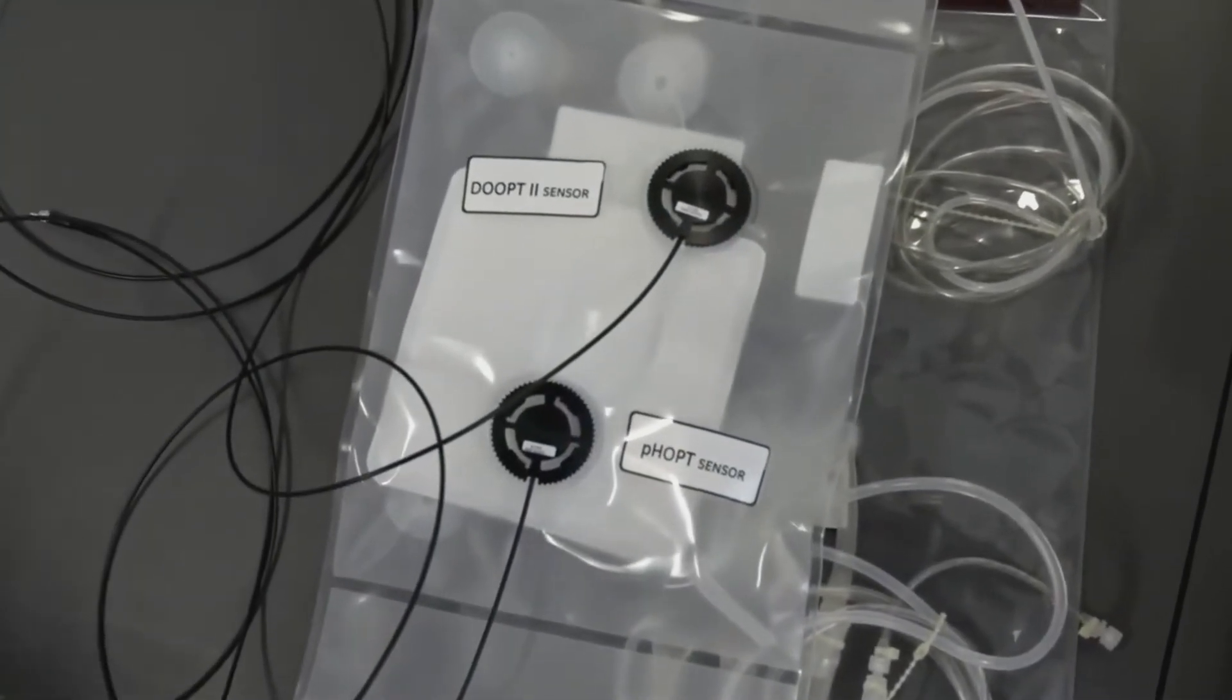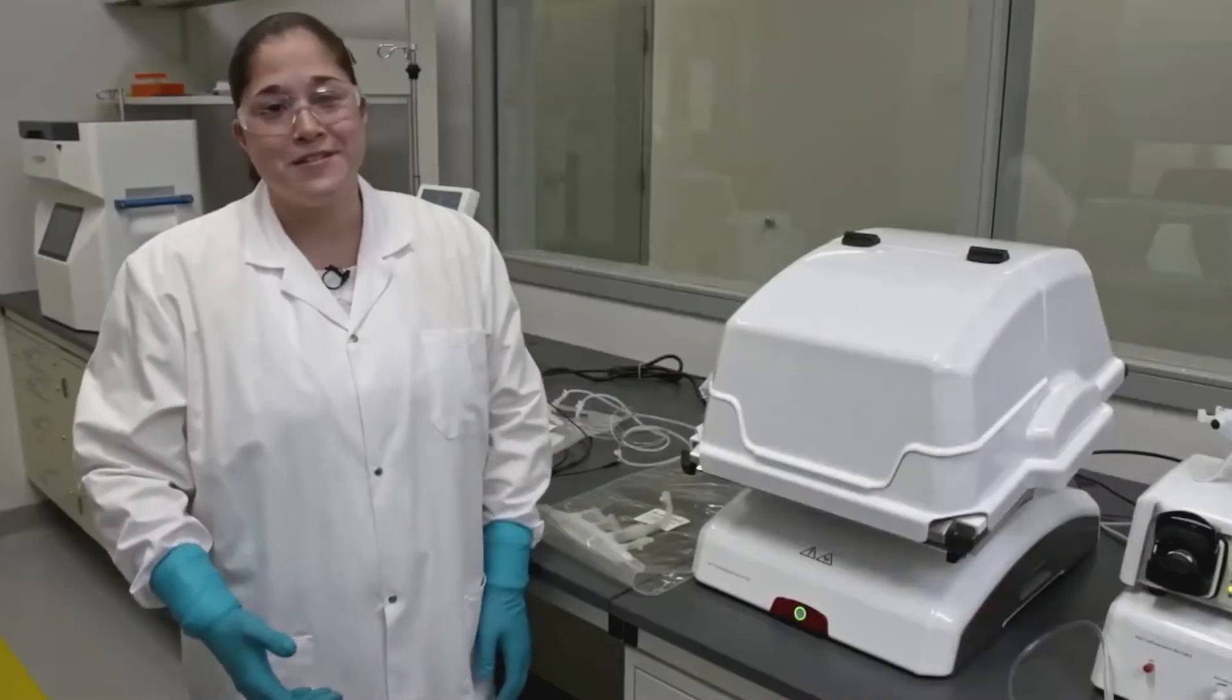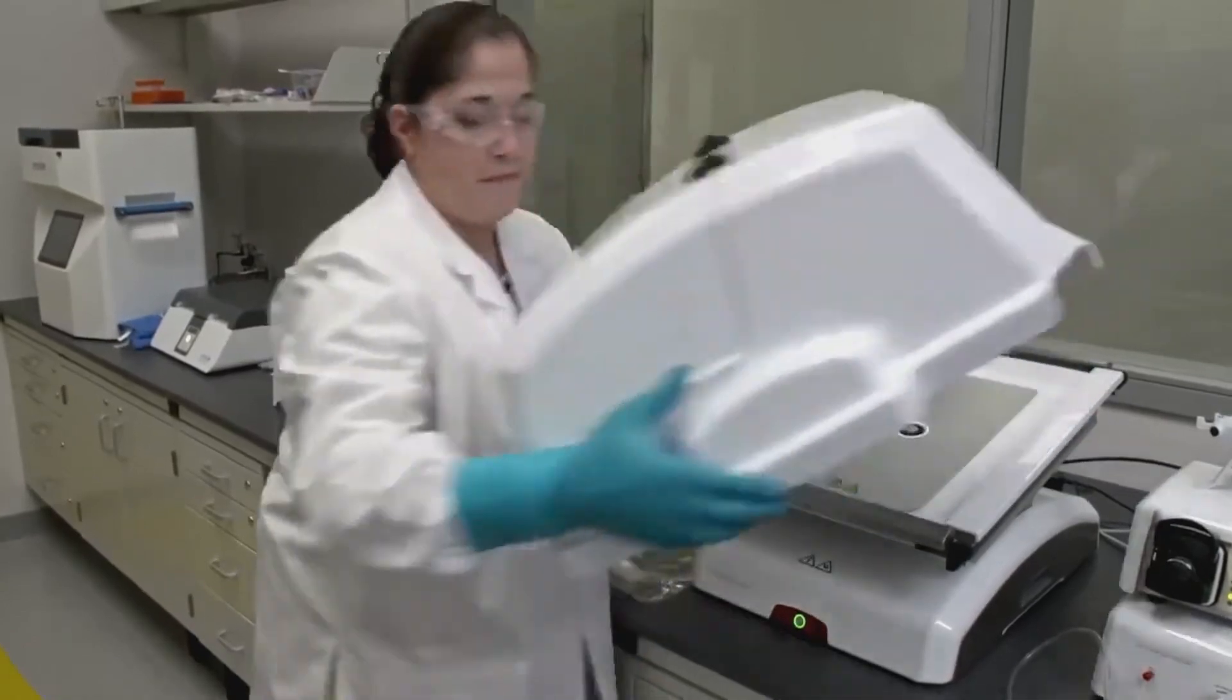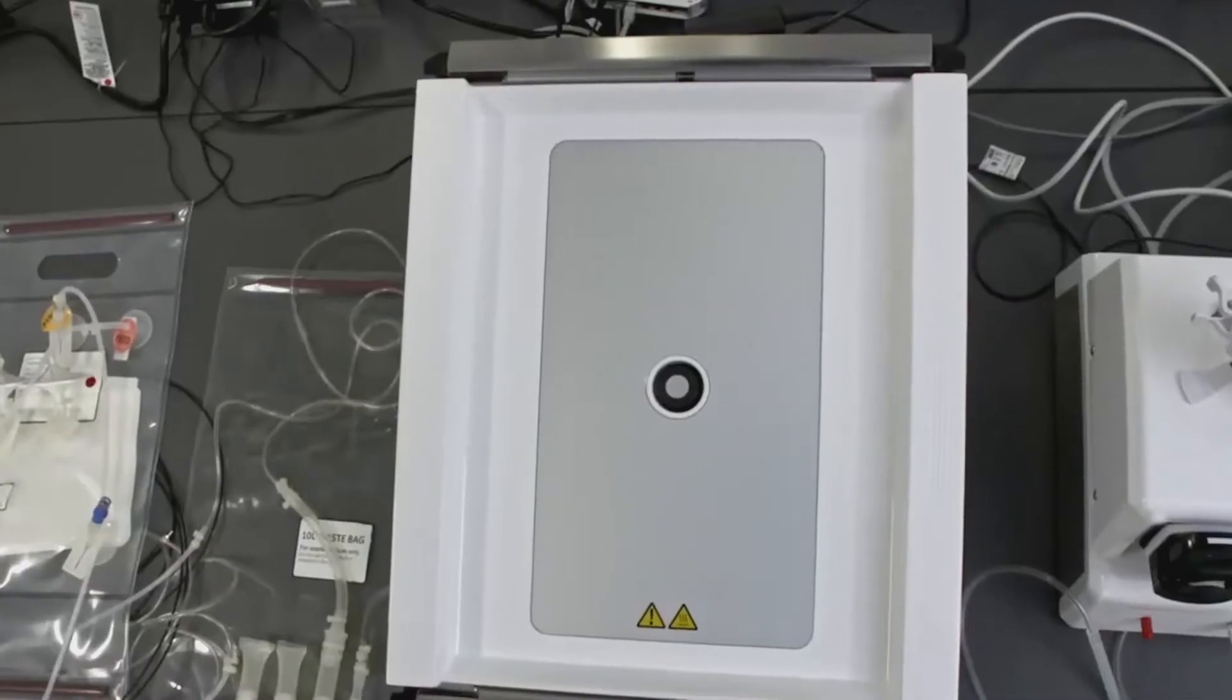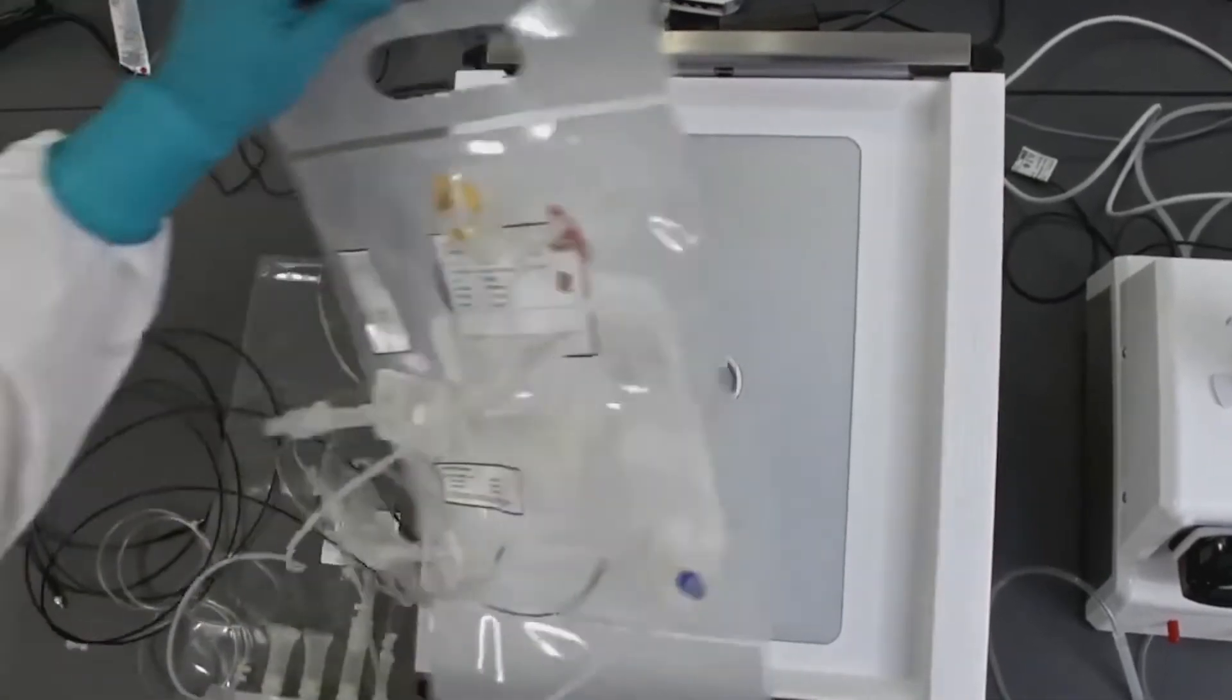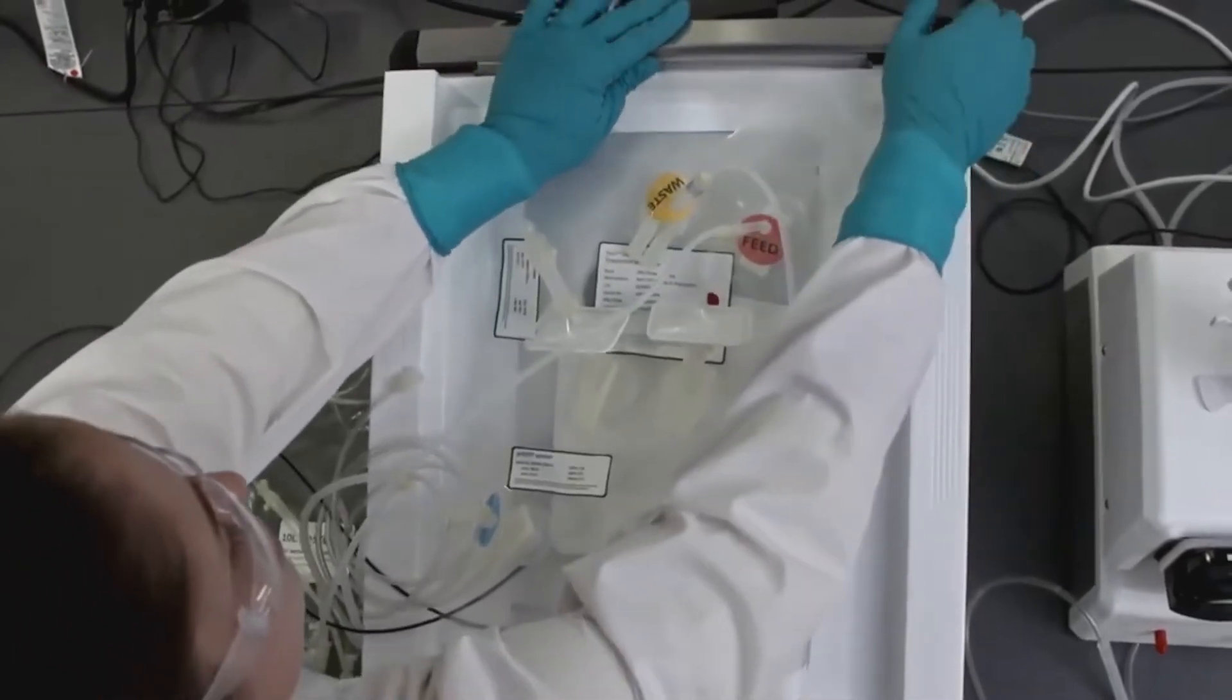You can now connect the cell bag to the rocking platform. To install the cell bag, you'll first remove the cover off the W25 and then connect the cell bag onto the rocking platform by putting the rods into the upper and lower clips.